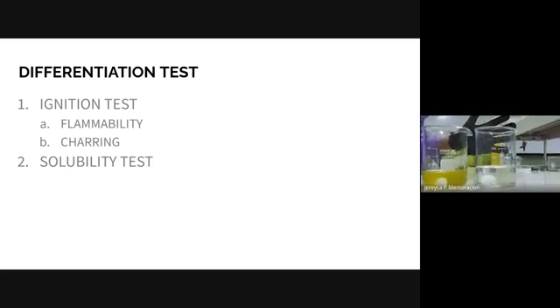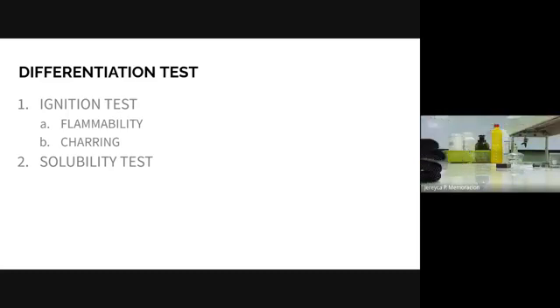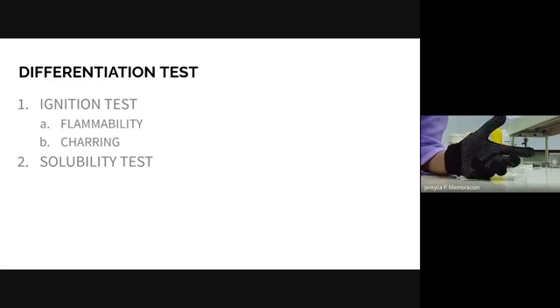So that's the end of our laboratory activity. For the question in your laboratory manual, write your generalizations stating the observed properties of organic compounds.